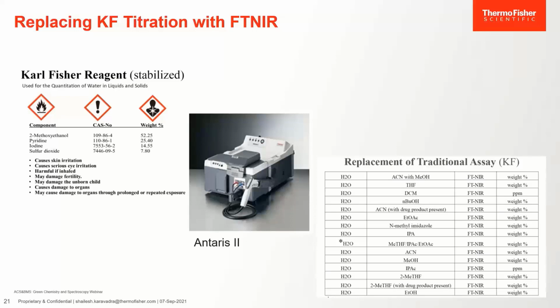Thousands of samples are being tested daily worldwide using Karl Fischer titration. And it does have detrimental effects on the environment and also on the personnel that operate the chemical analysis equipment. They have to handle halogenated reagents as well as the generated waste. And the halogenated waste produced by processes such as Karl Fischer titration for water content determination can ultimately pose corrosion risks to equipment, health risks to people, and damage to the environment too.